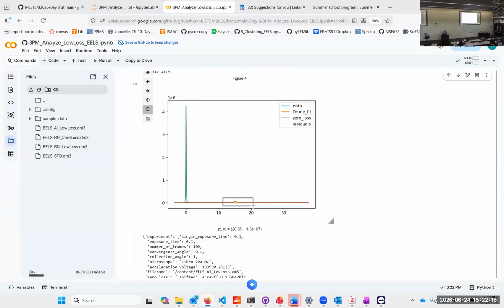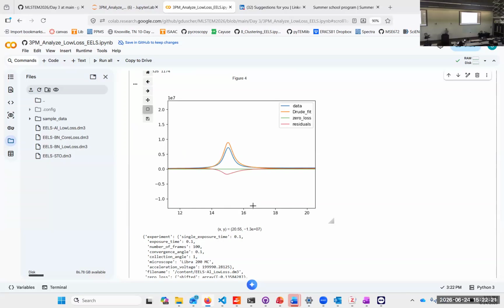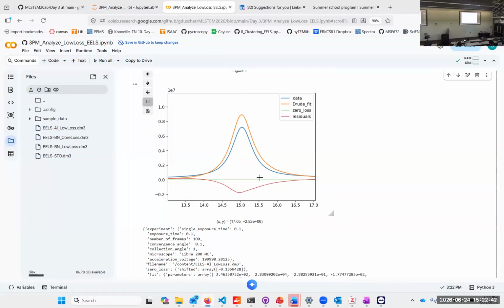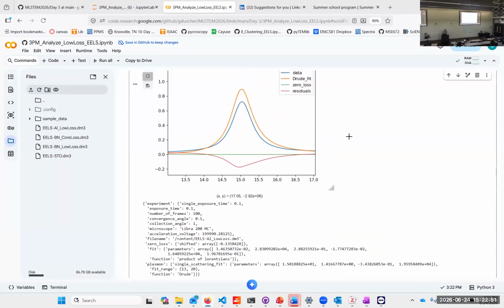And this formula is based on the Drude theory, right? We had said better before, I must say. Broader plasmon peaks are much better represented. And okay, not quite sure what's going on, so obviously it's not perfect here.